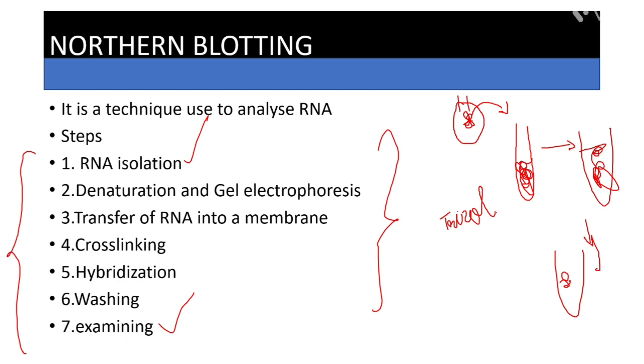Talking about trizol, it's an acidic solution, and it consists of guanidinium thiocyanate, then phenol and chloroform.